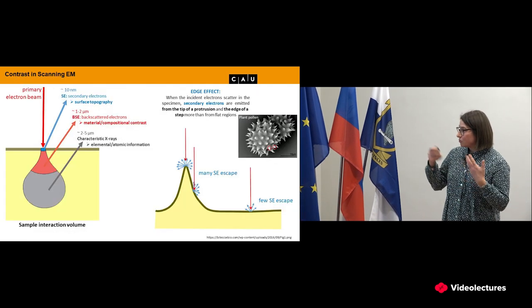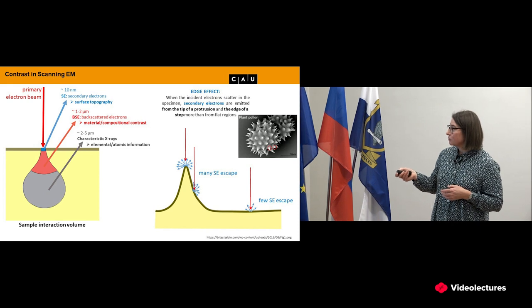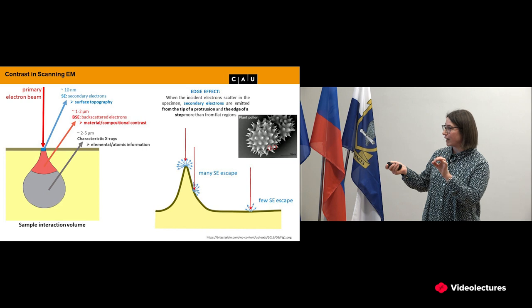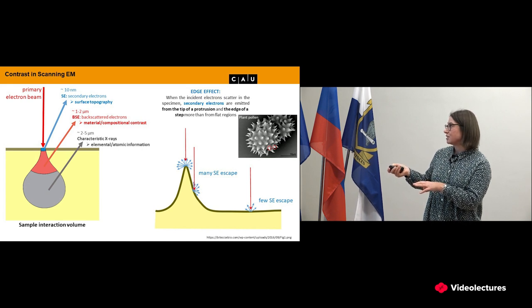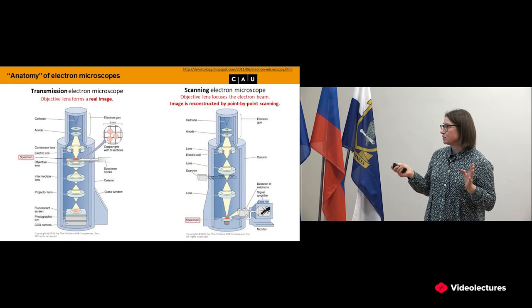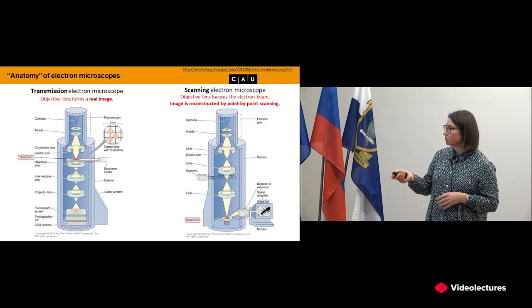And this is again just about the scanning, where it's different. We are coating samples with a metal layer that makes them conductive, but is also the source of secondary electrons. So electrons come, and they are more able to escape from pointed surfaces or from slopes or slanted areas rather than from the flat. So what we see as brighter is where it is usually pointed, where electrons can escape better. This was a little bit of theory, and there are two different microscopes.